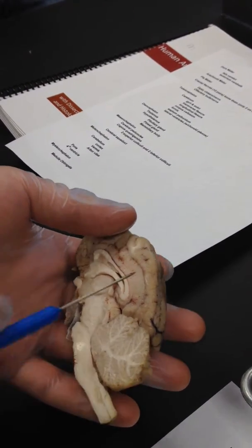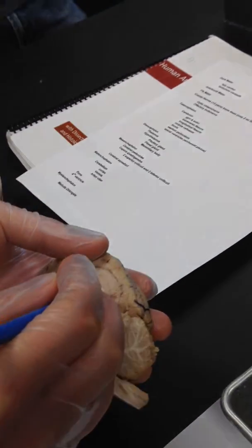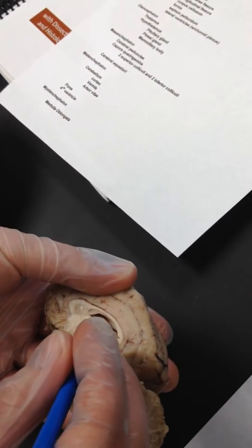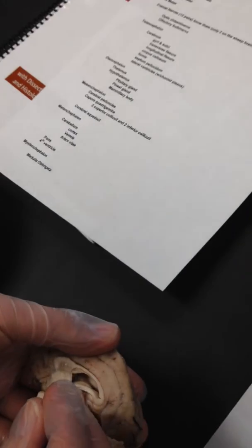Lateral ventricles. If you go deep to the septum pellucidum, you can open this thing up and you can see inside. Up here, so these are your lateral ventricles inside of here. Okay.